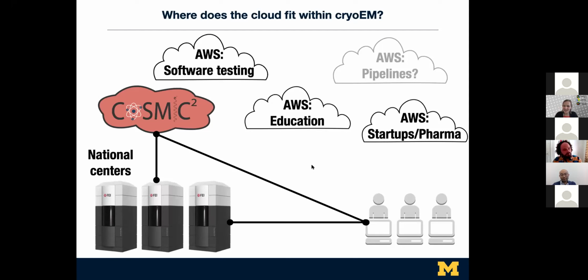When the job runs, it will run in the same logical directory structure. But I saw the question go by about the default_pipeline.star, which keeps track of your job history. We haven't updated that yet. It would be easy to do, or just to write something that would do that. So we haven't done that yet, but we could. The data does get output into job number folders, so it would keep some of the structure.